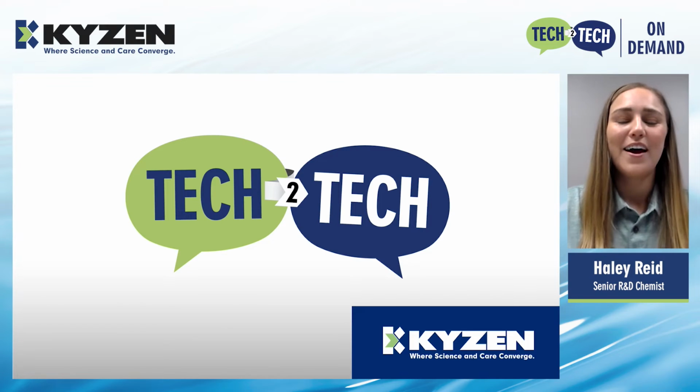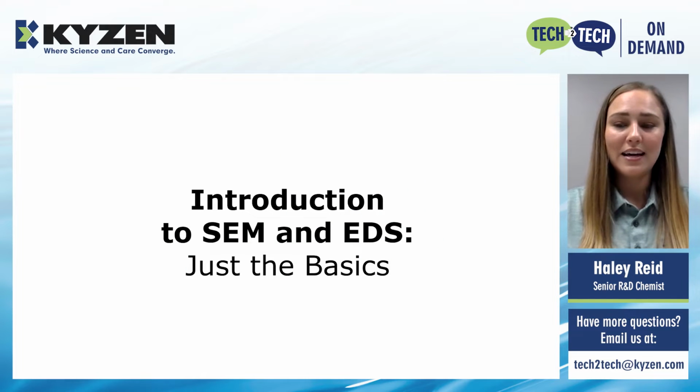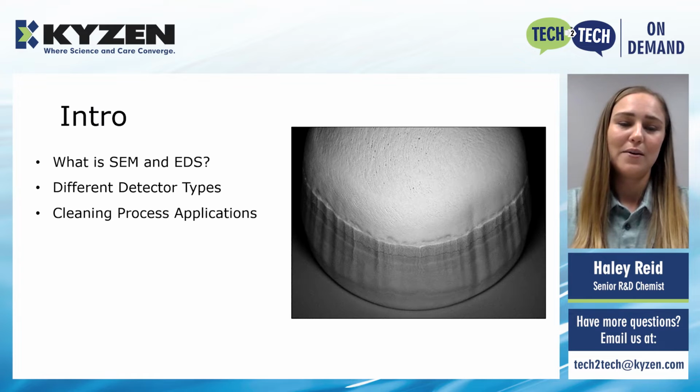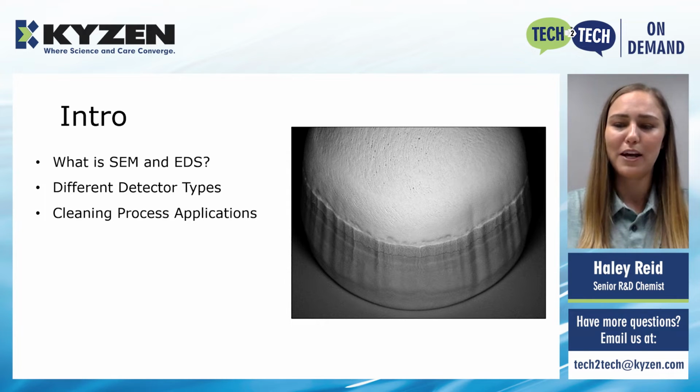Thanks, William. Today in our Tech to Tech, we are going to talk about SEM and EDS. We're just going to do a basic introduction to it. What we're going to go over is what SEM and EDS is, what the different detector types are, and how you can use it in your cleaning process application.